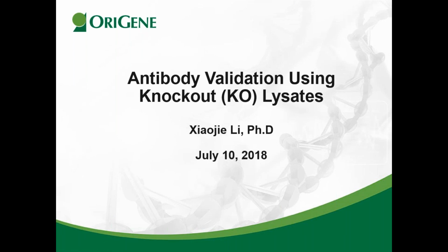So today we are going to talk about antibody, which is the most popular research tool in the lab. Its popularity is due to its perceived specificity. Note that I use the word perceived as specificity is a relative term. While antibody manufacturers, vendors, and users all try to use various means to provide evidence that the antibody is specific, yet there is always some blind faith in this topic.